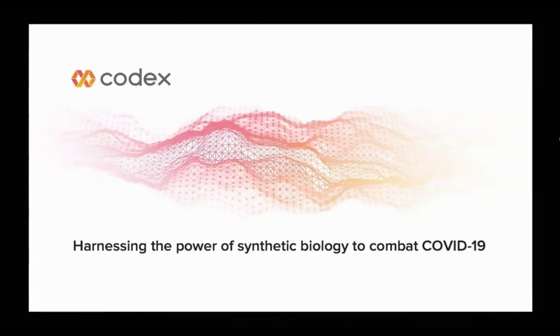Next, you will hear from Katie Lyons, who is a senior scientist at Codex. Katie has been a part of our organization from day one and worked with the engineers to get the biology running on the BioXP instrument. She will discuss the BioXP and its capabilities. Then you will hear from Krishna Kannan, who is a staff scientist at Codex. Krishna has been on my team for several years and has played important roles in several synthetic cell projects. He will discuss how he used the BioXP to rapidly construct the complete SARS-CoV-2 genome.